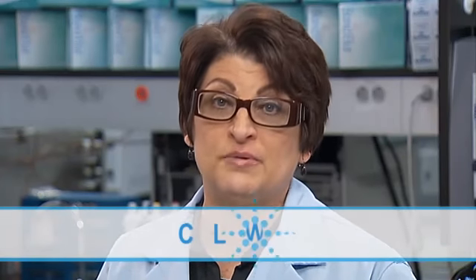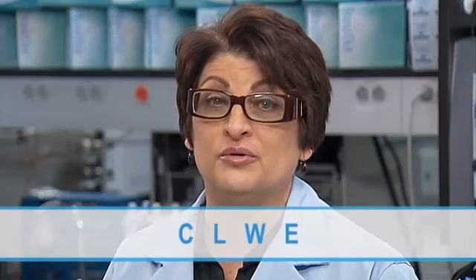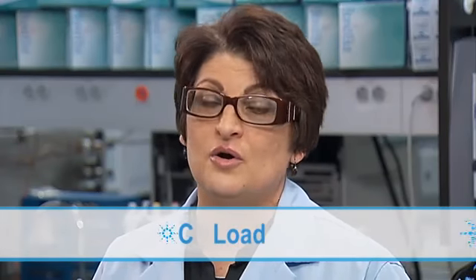There are 4 basic steps to every solid phase extraction method. A simple way to remember the 4 steps is C, L, W, E, pronounced CLUE. CLUE stands for condition, load, wash, and elute. Understanding the importance and purpose of each of the steps can be extremely helpful. Being familiar with this makes incorporating SPE into method development and sample preparation as easy as 1, 2, 3, 4.